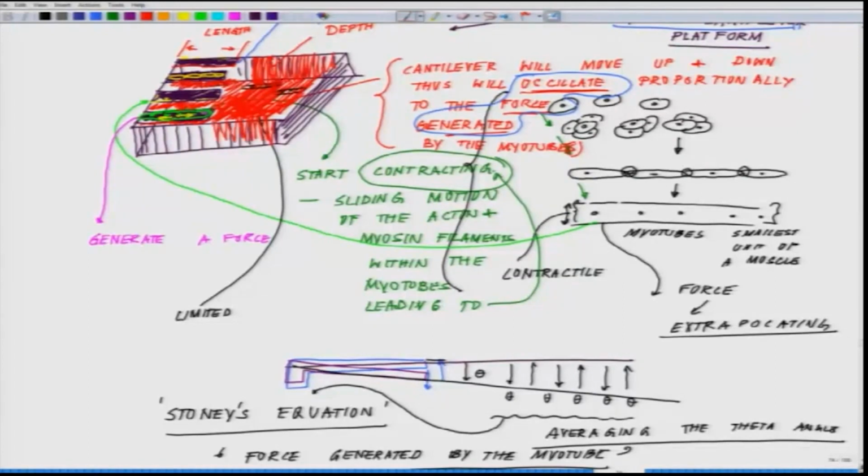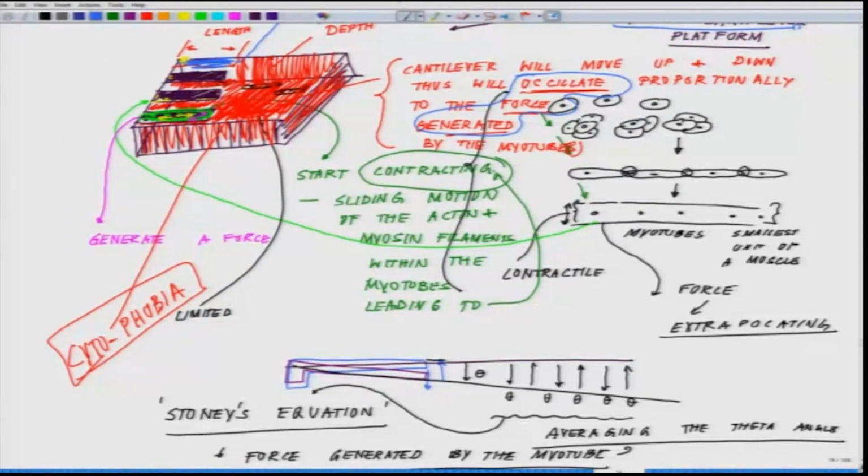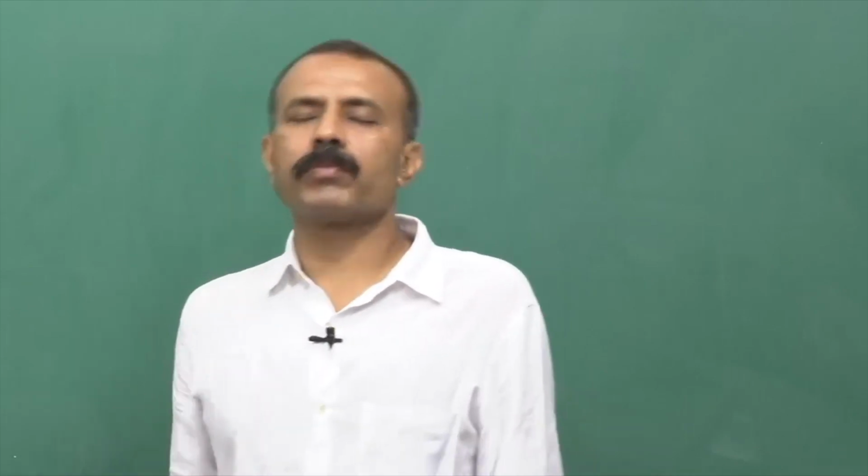Okay. So, you are ensuring that these surfaces are cytophobic. The cells have a phobia to grow on these surfaces. And in parallel, you coat the other surfaces with something which will allow the growth of the cells. Now you have the cantilevers which will promote the growth, and you have the background which will not promote the growth.